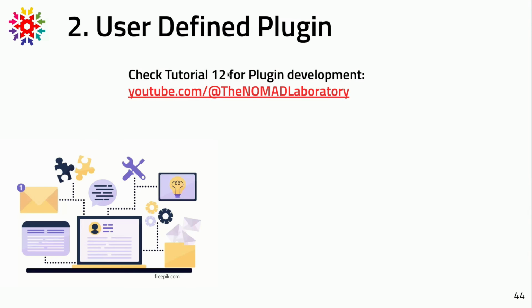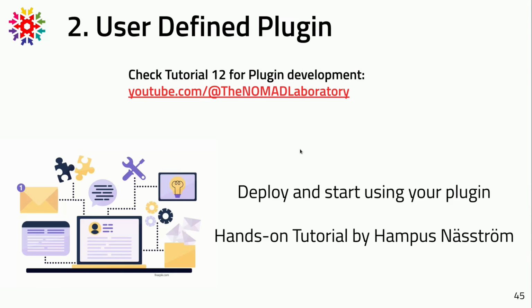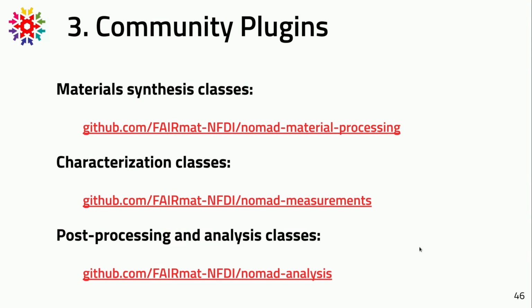Okay, so you can check the tutorial 12 for a better explanation on which are all the features or functionalities that we can think to code within a plugin, so to have a better understanding of the plugin development. And what will happen in the subsequent part of the tutorial will be, let's say, a showcase of how to deploy and really start using your plugin. So it's not about the functionalities we can code, but how to really make it work. And this will be shown by Hampus later.